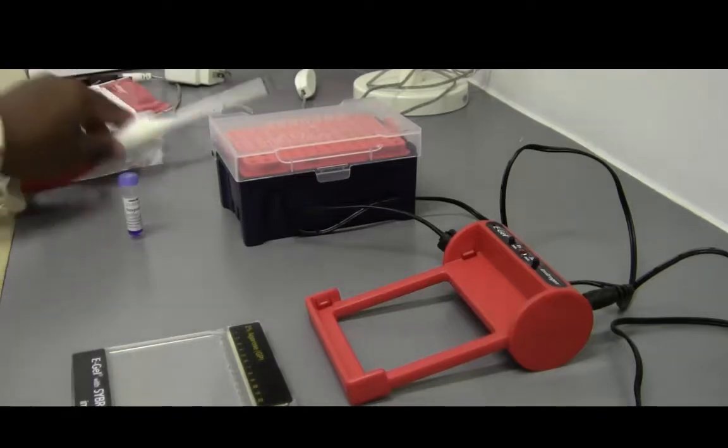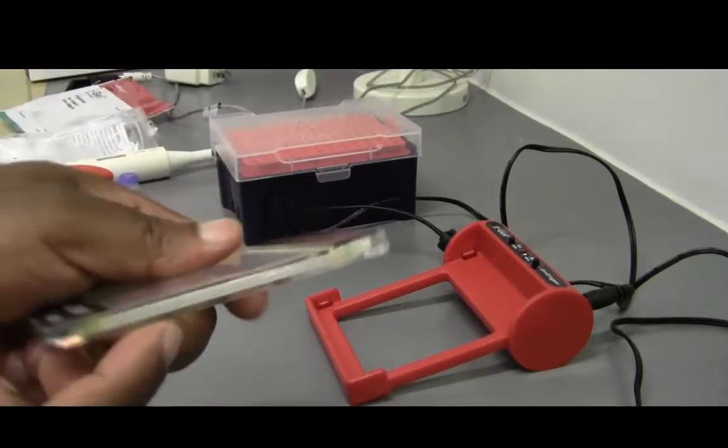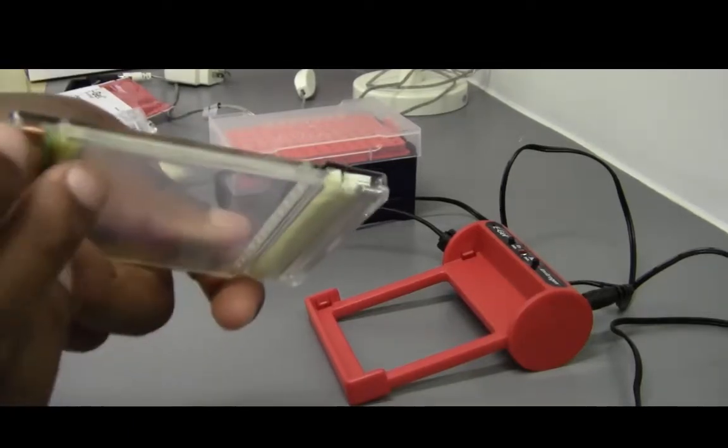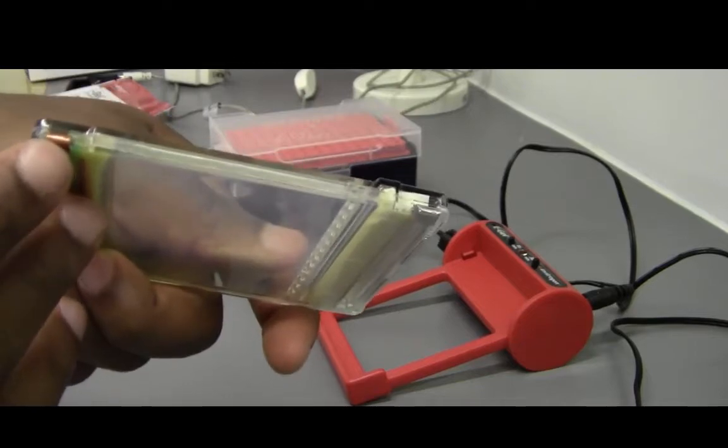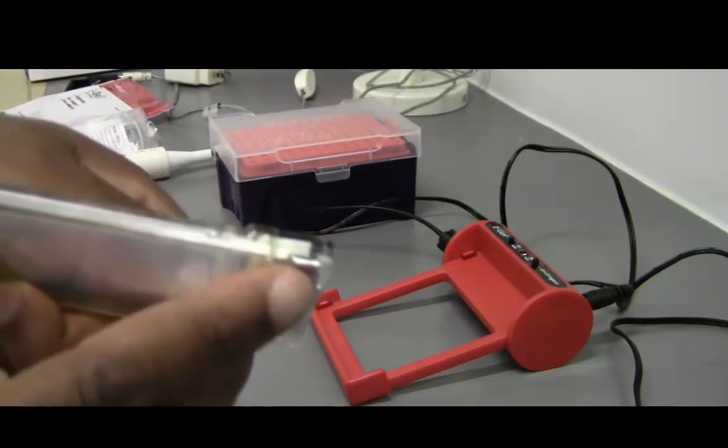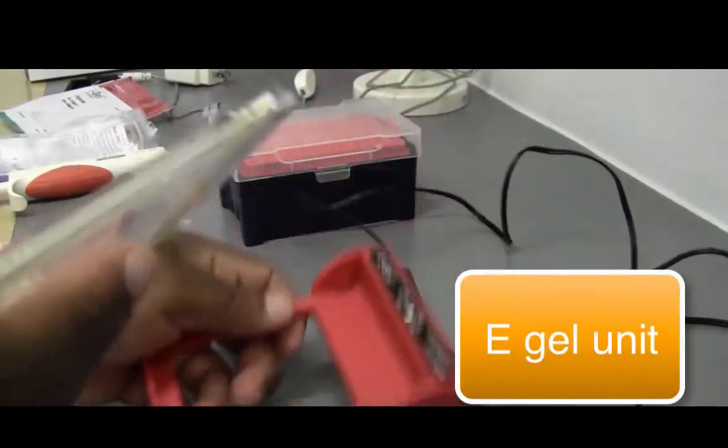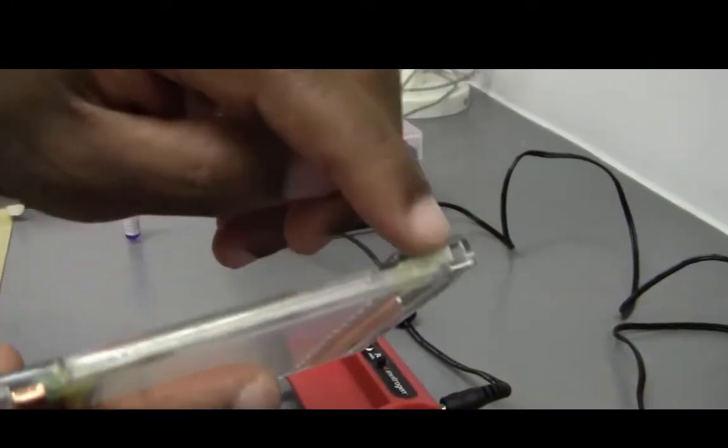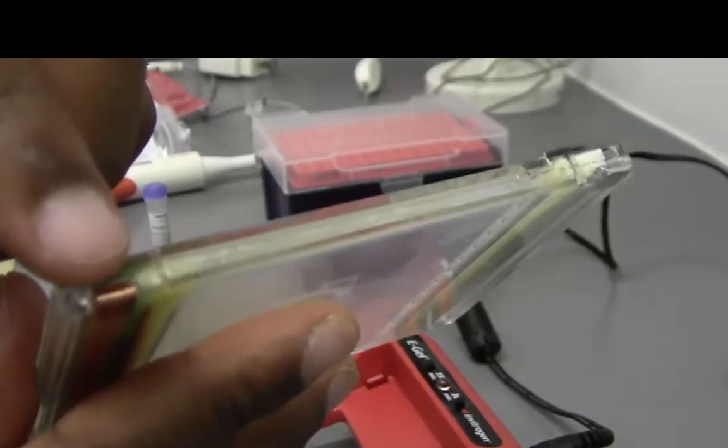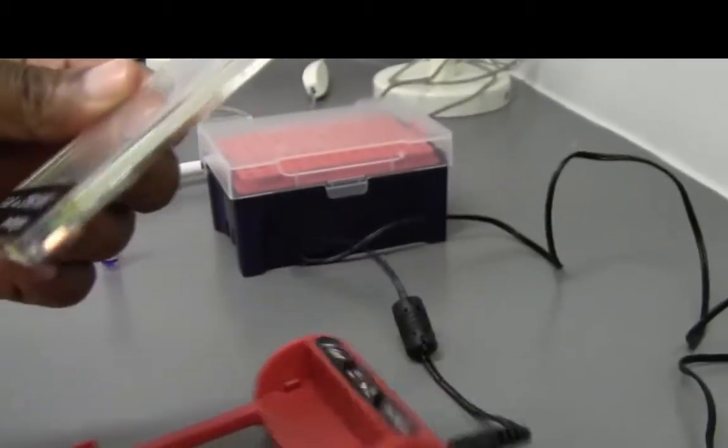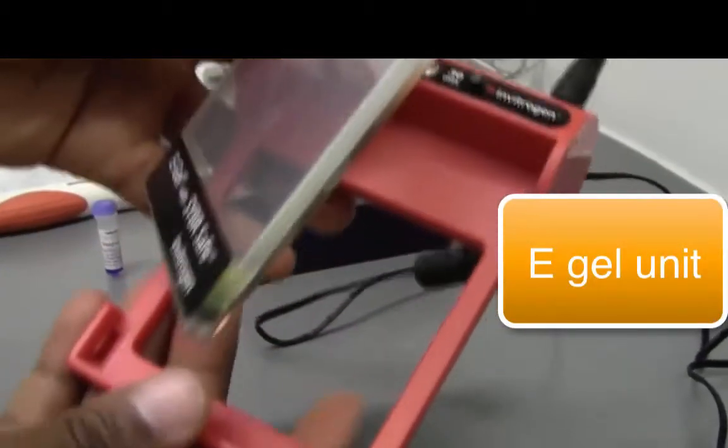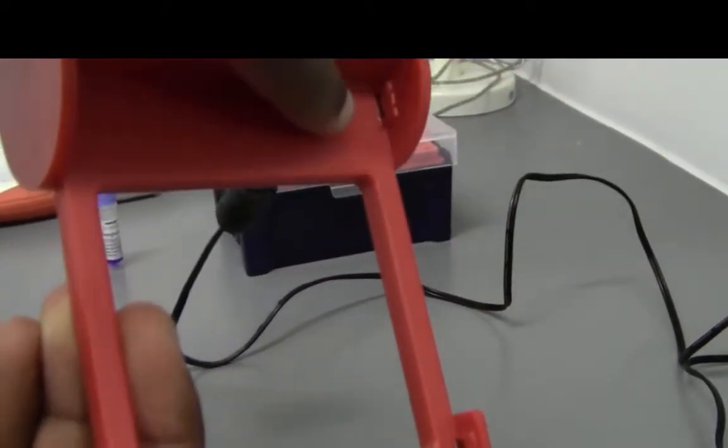Once you're ready then you'll notice that there's sort of a copper and a silver lead there. This is the E-Gel and what you have to do is you don't want this or this to get ripped. So when you insert it into the E-Gel you want to make sure it comes in contact. You'll see the sort of metal components under there.